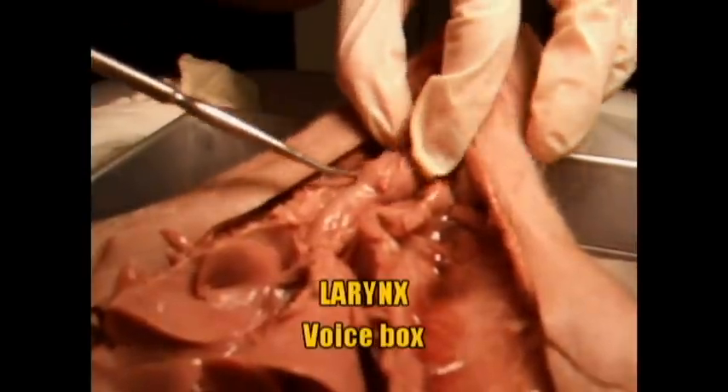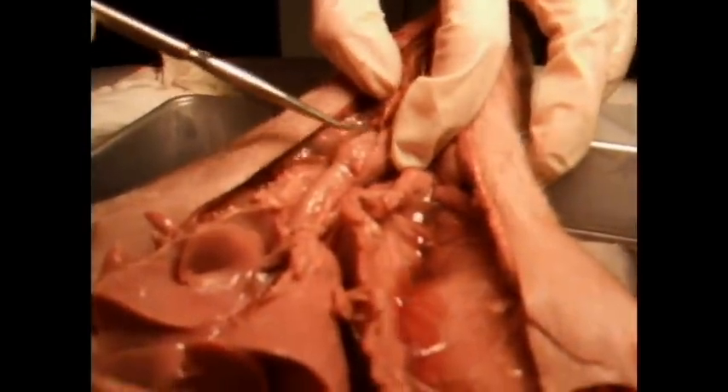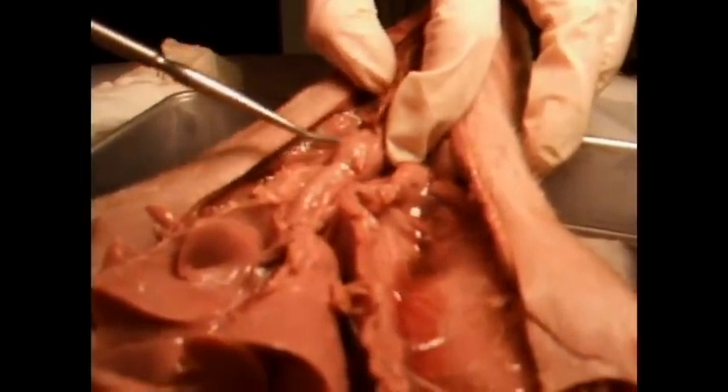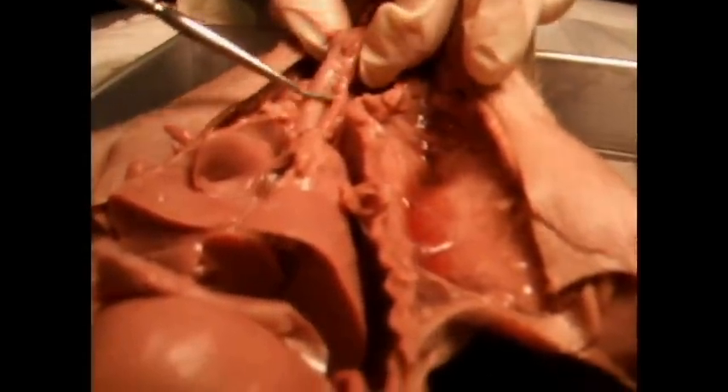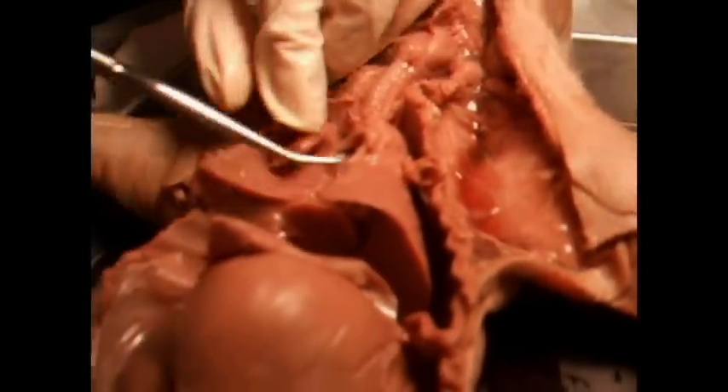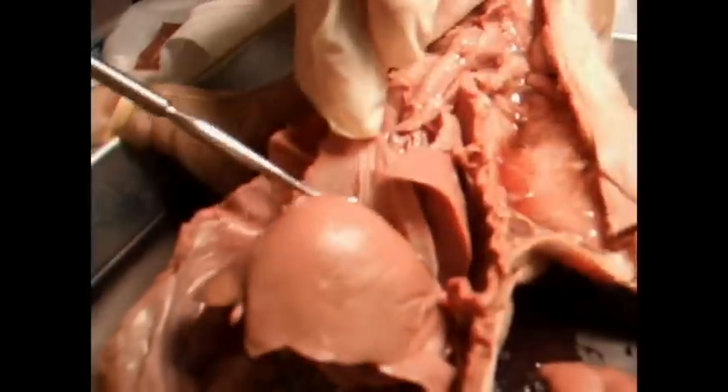Now up here is the larynx, also known as the voice box — it's pretty thick. So: larynx, trachea, esophagus, which deals with the digestive system, and then your lungs and your diaphragm.